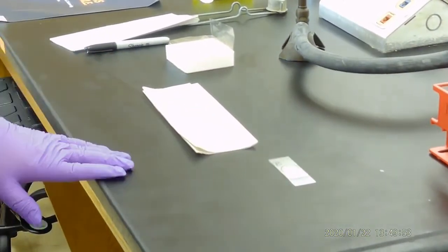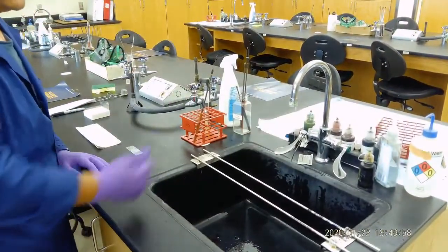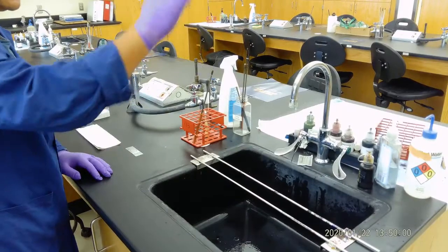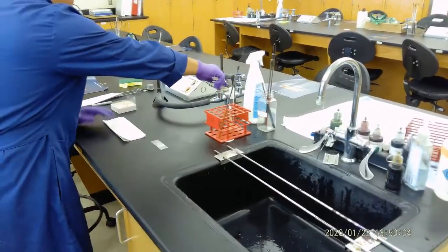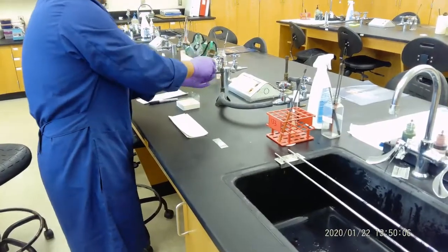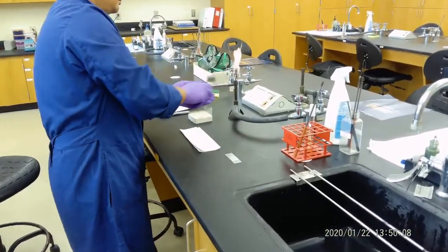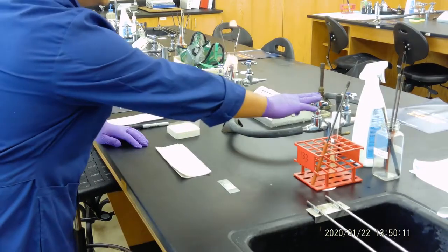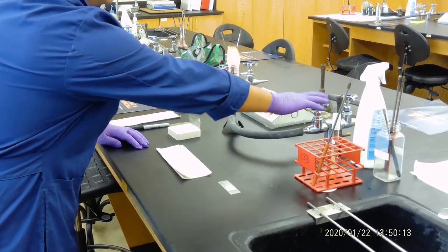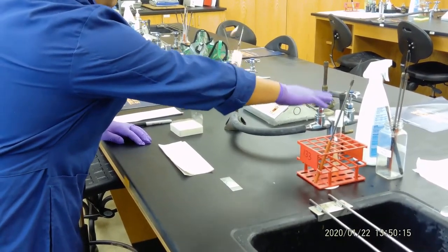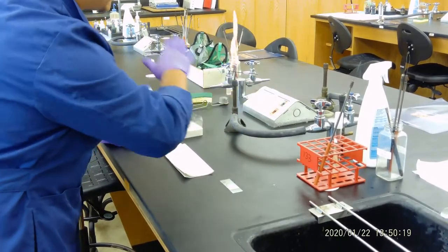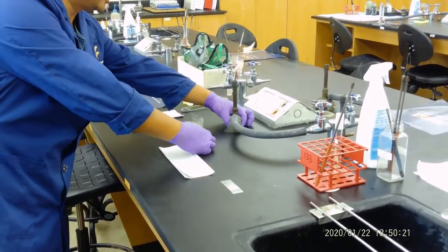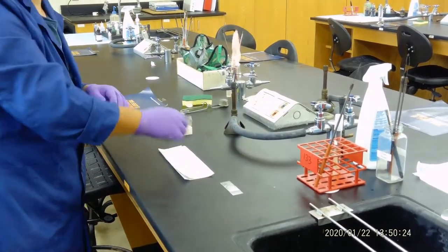Before we do this, water needs to be turned on a little bit. Let it be running very slow, not flushing. And then we turn on the Bunsen burner. You will see there is a switch which is for the control of the gas coming, and also the switch at the bottom, which is for the amount of the fire.